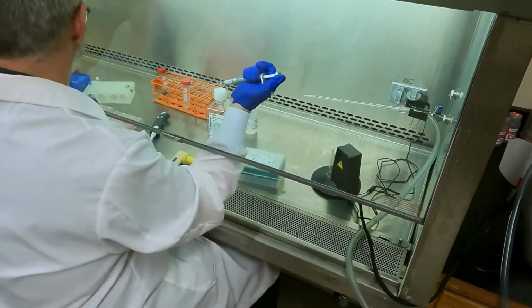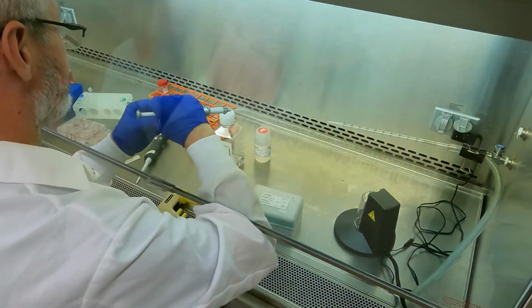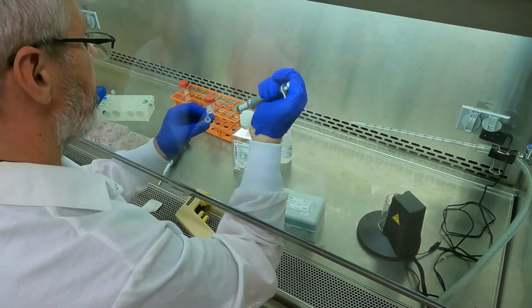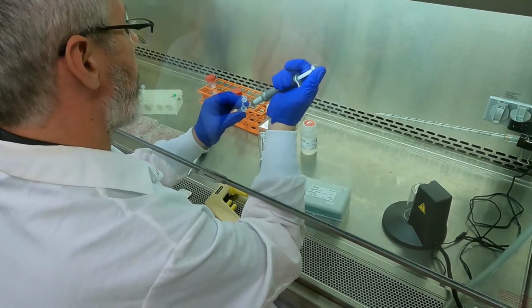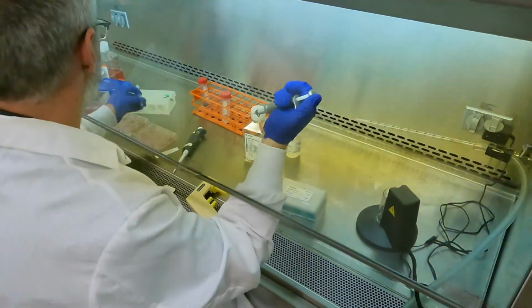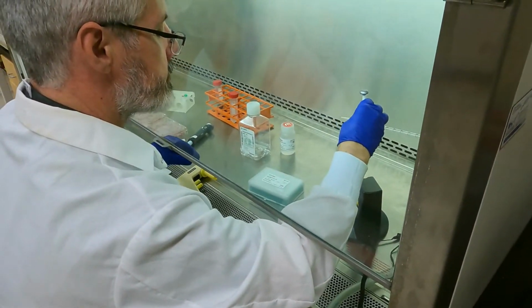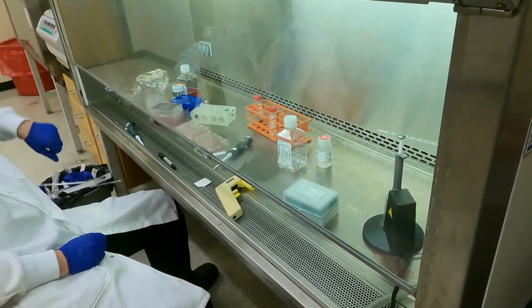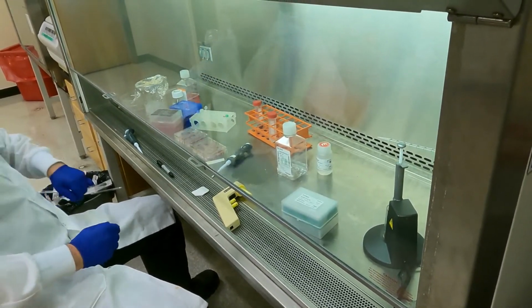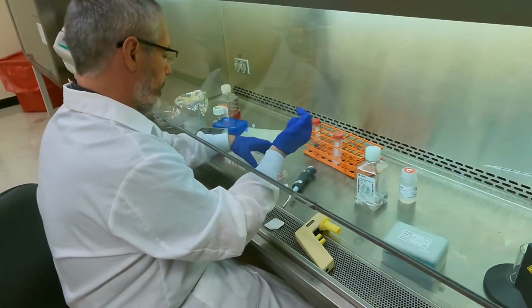I bet the DNA one doesn't work now. This is the DNA control. This should make the cells go green because there's GFP, green fluorescent protein, from Victoria aequorea. There we go. And we pop that in like this. Okay, Tommy. Cool. Right, we've got the control now.